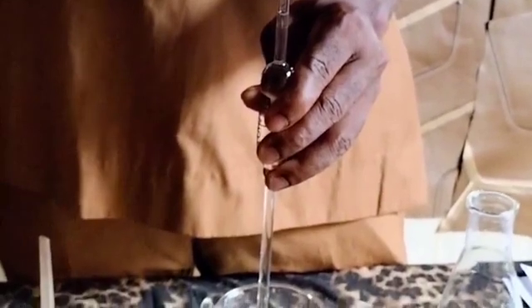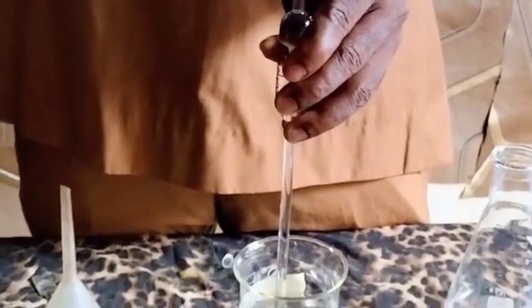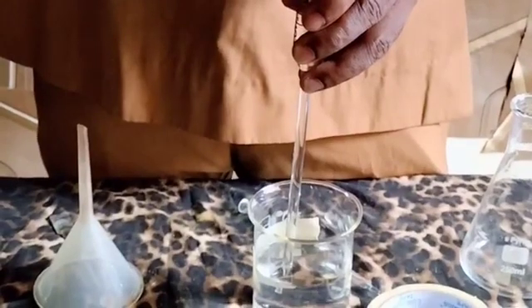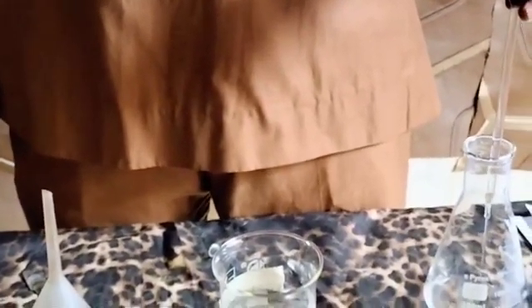If you have a suction pump, you can use it instead of using your mouth. You can as well use a measuring cylinder. So you just drop it at the bottom, take it up, don't blow the last drop, and then remove your hand, empty it into the conical flask.